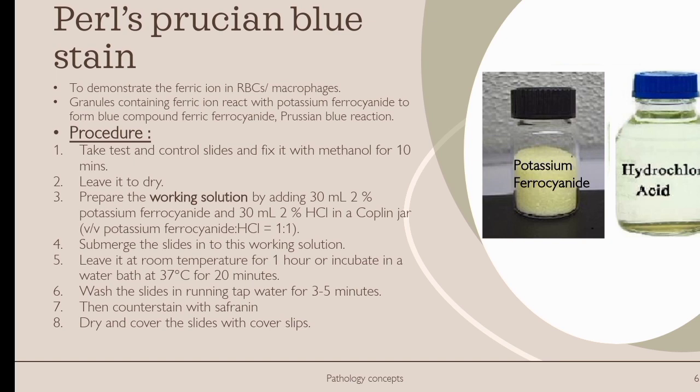Leave it at room temperature for 1 hour or incubate in a water bath at 37 degrees centigrade for 20 minutes. Wash the slides in running tap water for 3 to 5 minutes. Then counterstain with safranin. Dry and cover the slide with a coverslip.